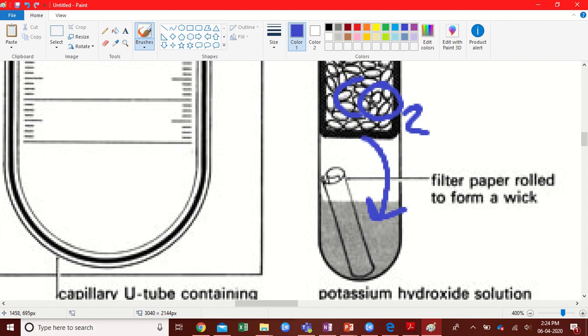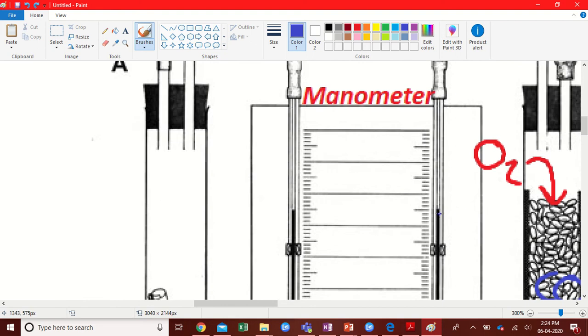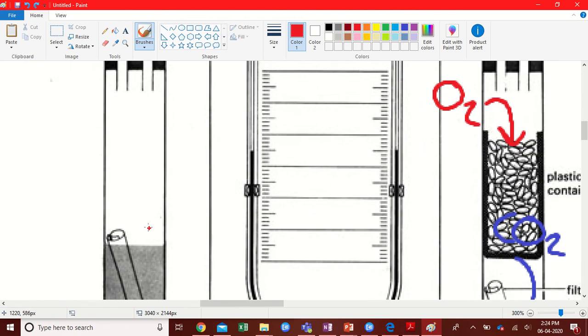So what you've got on the left hand side is the same setup, just without the seeds. So there's no respiration occurring here. So it's a bit like a control tube, but at the same time, because nothing's happening, the fluid in the manometer will happily be moving up this way because of the amount of reduced oxygen in the air in test tube B. So that's pretty much it.